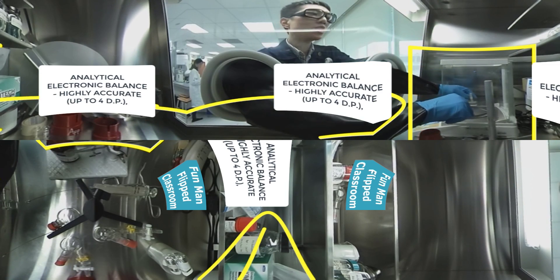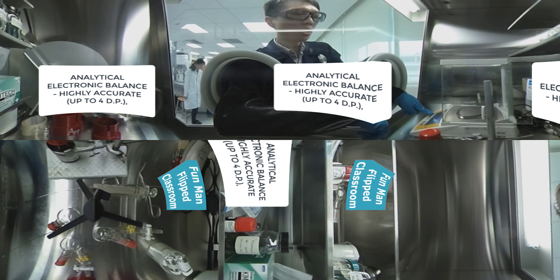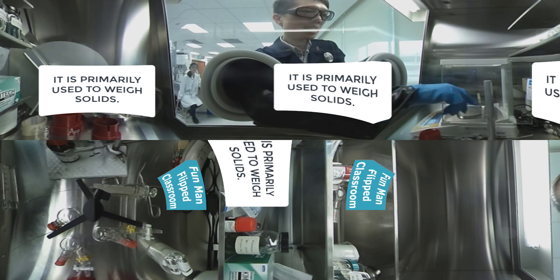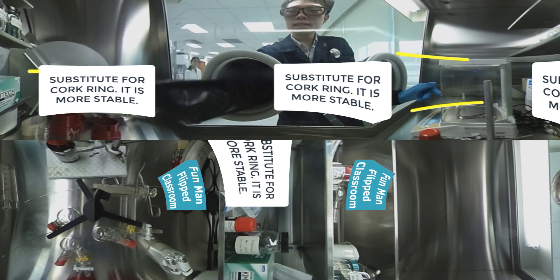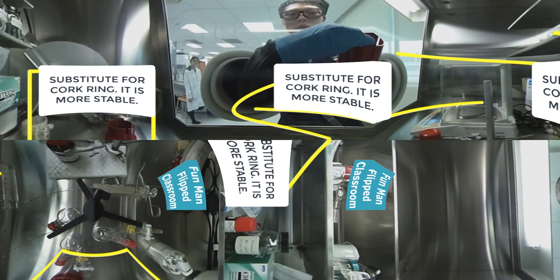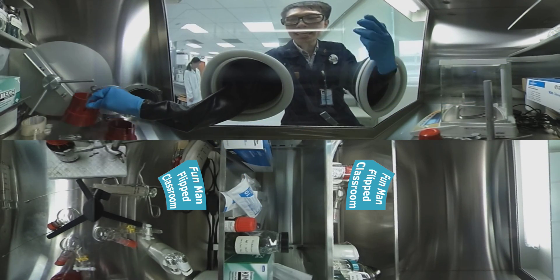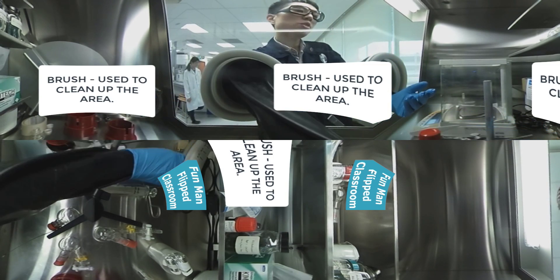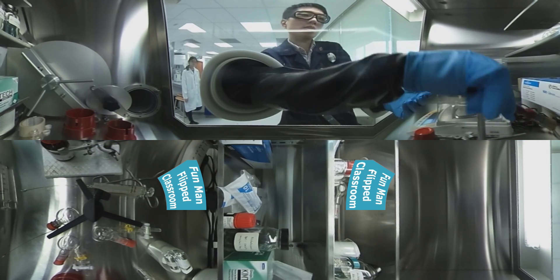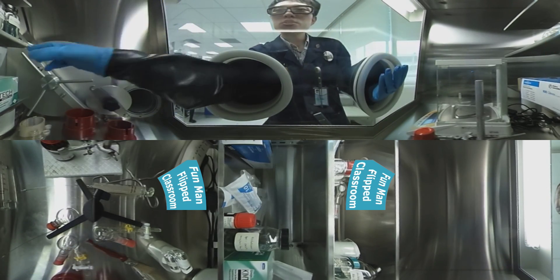In front of us we have an analytical electronic balance — highly accurate up to four decimal places in grams — used primarily to weigh solids. This ring-color stand is actually a substitute for a cog ring; in fact it is more stable than a cog ring. Now I'm reaching out for a metal spatula to scoop solids for transfer. This brush is used to clean up the area — you brush it inside the glove box. It is always good to be responsible in the area of the experiments you deal with.